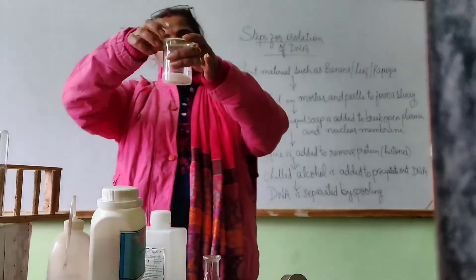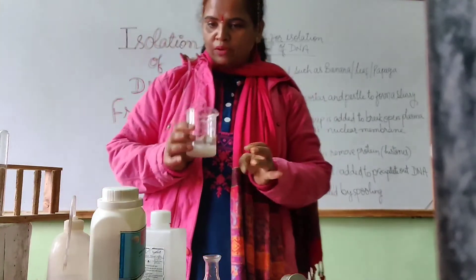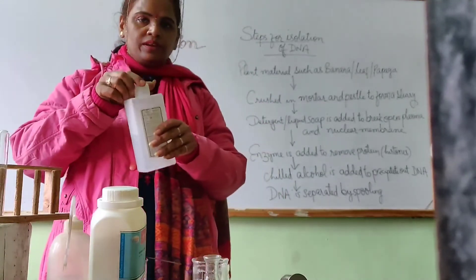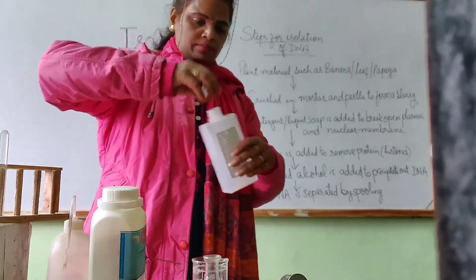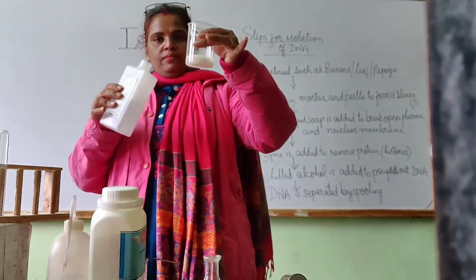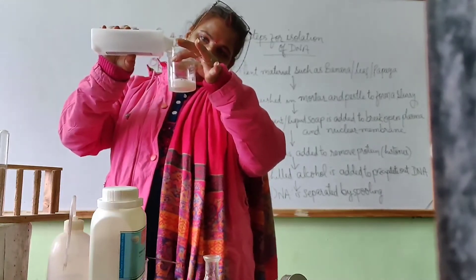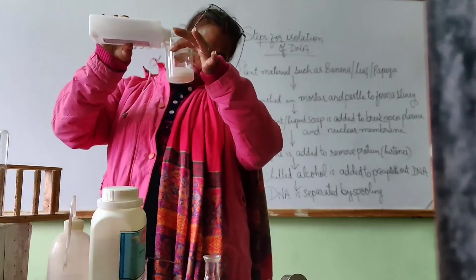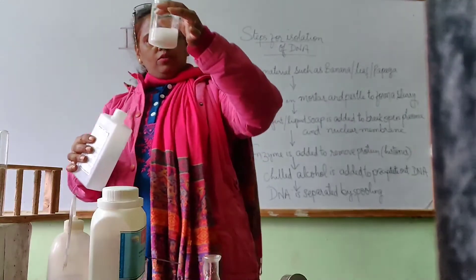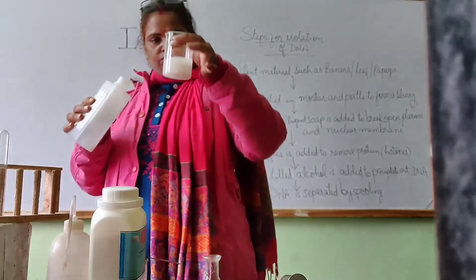But it doesn't matter, we should not stop our work. Now see — this is the separated solution. Finally, we take this chilled alcohol and pour this alcohol into this solution or mixture, and after some time you will notice some change in it.